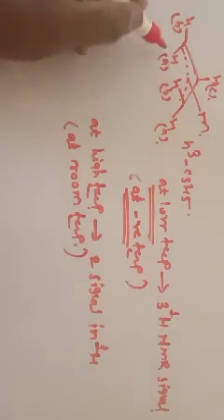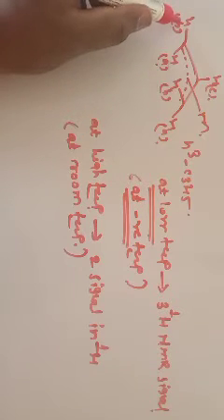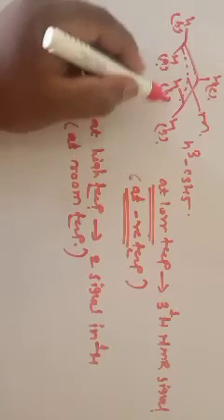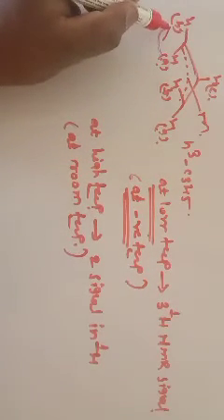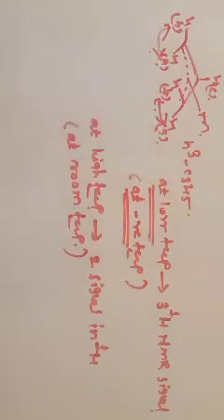So this A type of proton and this B type of proton, this AB type of proton, they exchange, and the exchange is so rapid that the NMR instrument cannot detect it, and therefore for these AB protons we get only one signal.